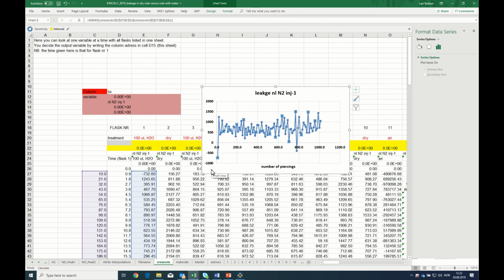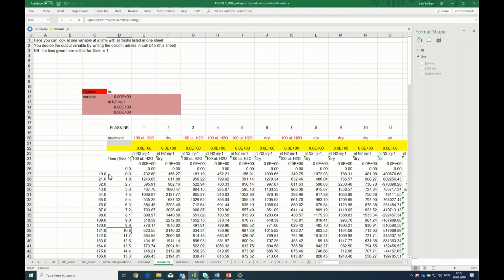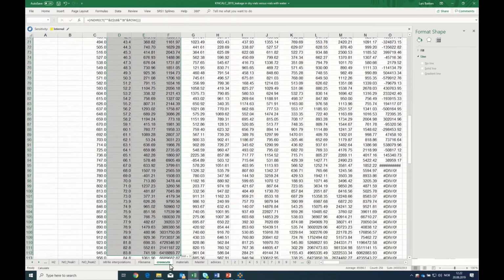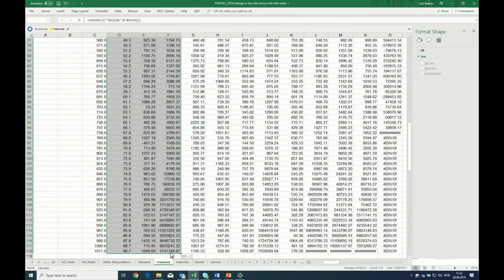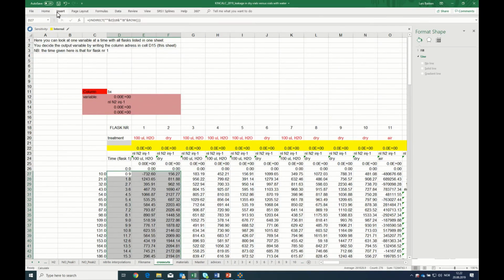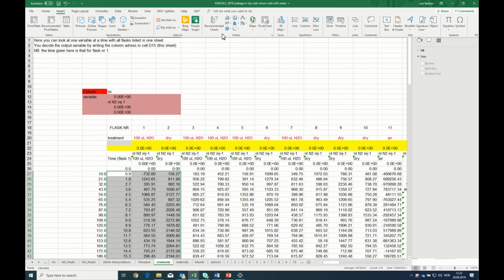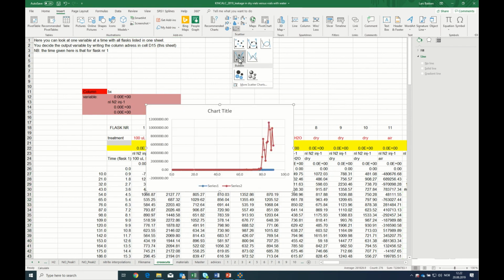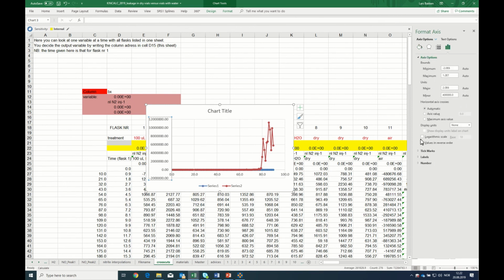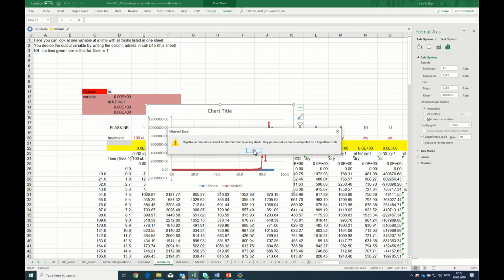No, it's not easy to extend it, but you can make a new one where we include two of them in one graph. And then in order to see the entire scale, we can change this to logarithmic values.